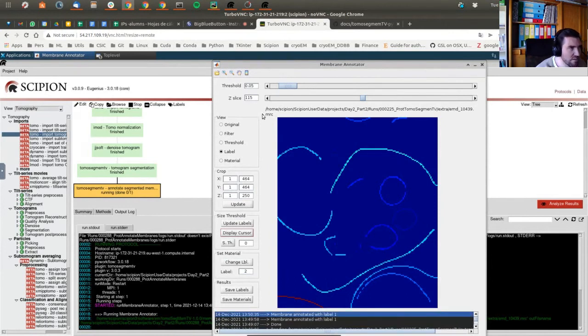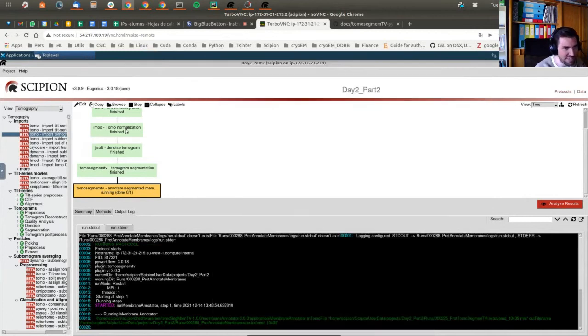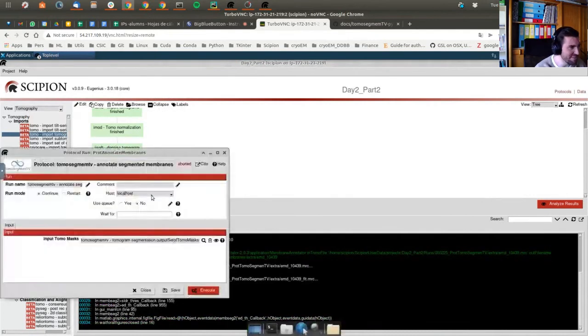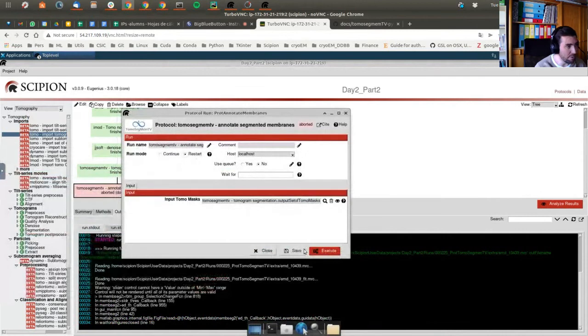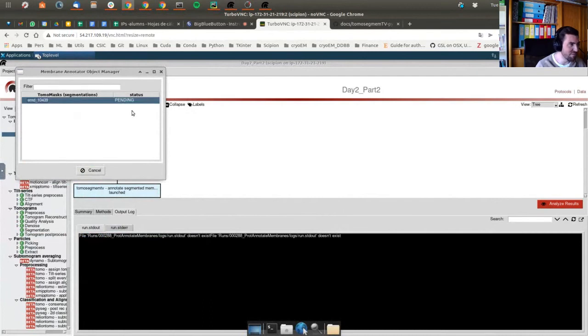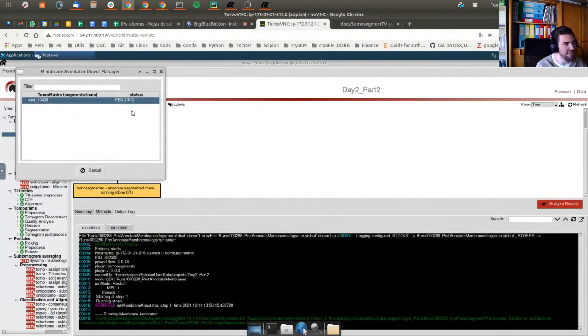I don't know why it is failing, because it worked when I did it before. If I use these cursors, I don't know how to pronounce it. I'll have a look at this. Yeah, I'm feeling tomatoes being thrown at me. Okay, let me redo it again. So another resume for all the people here. I apologize about this because I haven't found, believe it or not, these problems before. I don't know why. I'll have a look, and the software will be updated when it's solved.